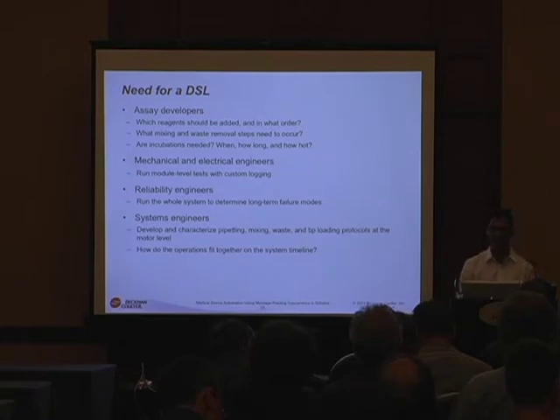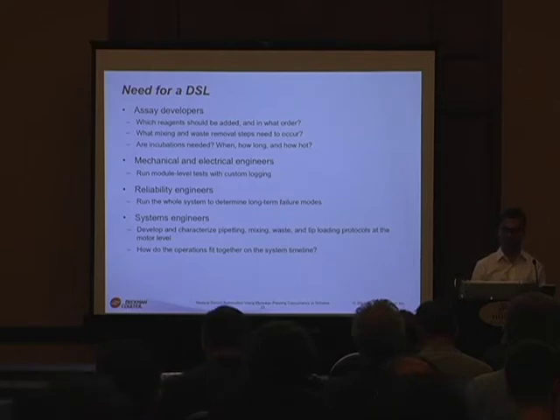So next, let's talk a little bit about the DSL. The DSL was written mainly so that we could have the scientists and other engineers, hardware engineers, electrical engineers, be able to use this instrument without having to be handheld by software engineers. We didn't want a layer of software engineers that they need to talk to, so that we act as the gateway of this is the only thing you can do on this instrument. So we wanted to give them a DSL which enables them to basically use the instrument the way they want to.